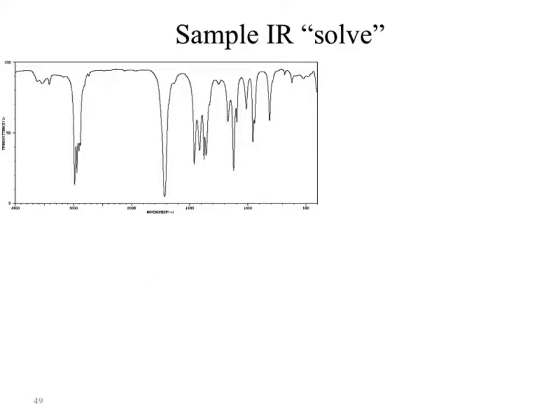10 seconds. What do you see? There's our 10 seconds. I have a CH. Okay, it's falling in that range. The question now is what kind of CH? I can draw down. Those are less than 3,000, which makes them SP3. That signal here shows up about 1,700, which means that is carbonyl. There we go. Carbonyl, carbonyl, I don't really care.